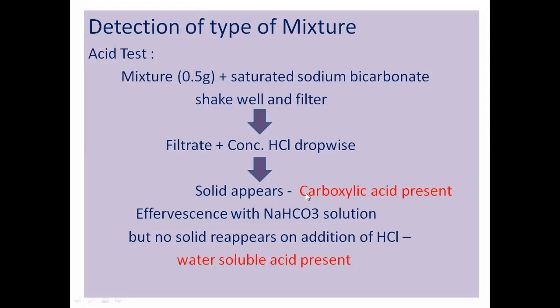So when you do that, you will get effervescence. Okay? When you take the mixture, you add saturated sodium bicarbonate, then you shake it and then filter. Then to the filtrate, you add the concentrated HCl. So what happens here, we are dissolving this acid into the water.